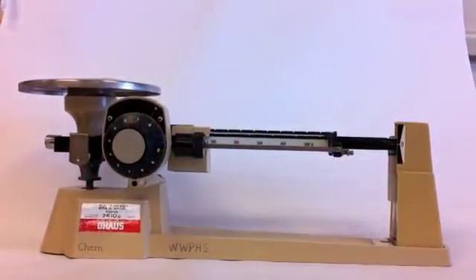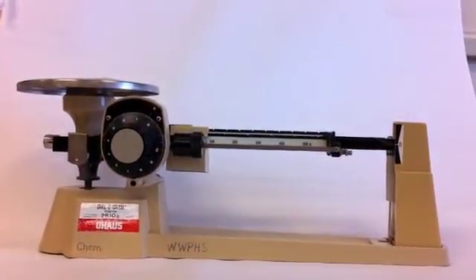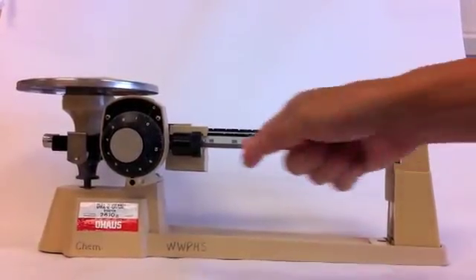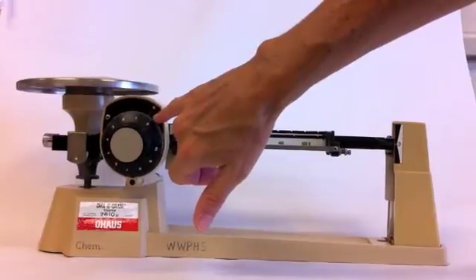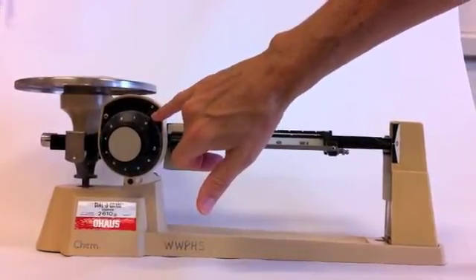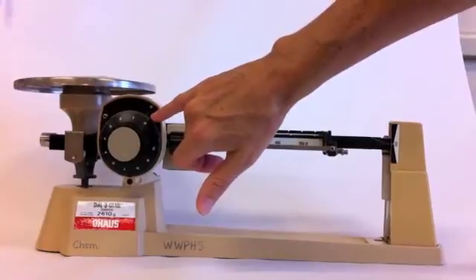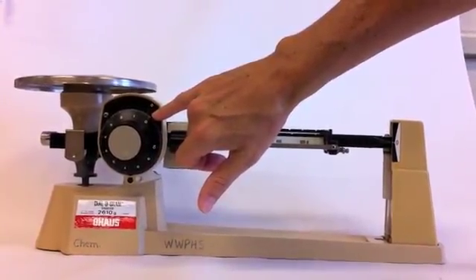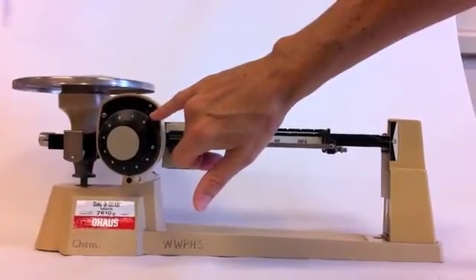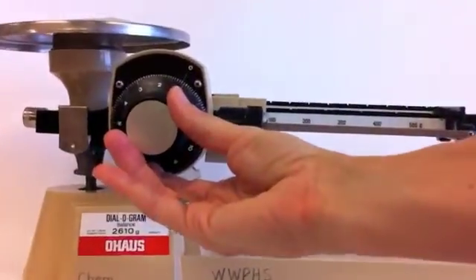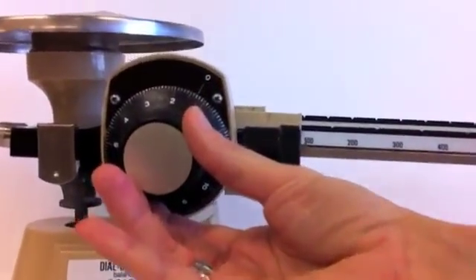And now, let's say I need one gram of salt. All I need to do, since it's at zero, is look at this. Right now, my weighing paper is approximately 0.3 grams. And I want one gram of salt. So, my final mass is going to be 1.3 grams. So, I'm going to use my dial-o-gram and move it to 1.3 grams.